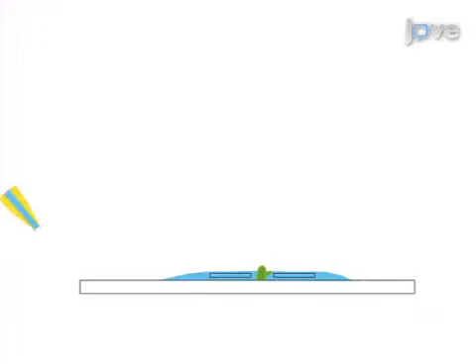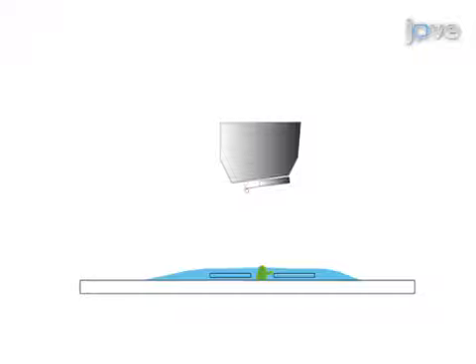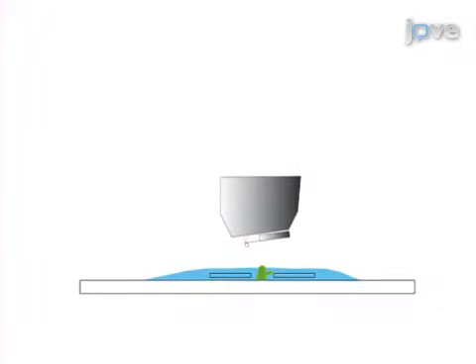Next, add enough melted mounting agarose to fill in the crack created when the meristem was embedded in the agarose film. The final step is to set up the atomic force microscope for data acquisition.